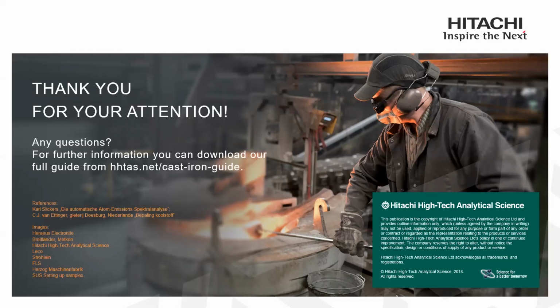One person asked, what can OES analyze at low levels of detection in cast iron? So OES can analyze a wide range of materials. Within cast irons, the most important elements that it can analyze are sulfur, boron, carbon, manganese, chromium, and nickel. And it can even analyze trace and tramp element levels.